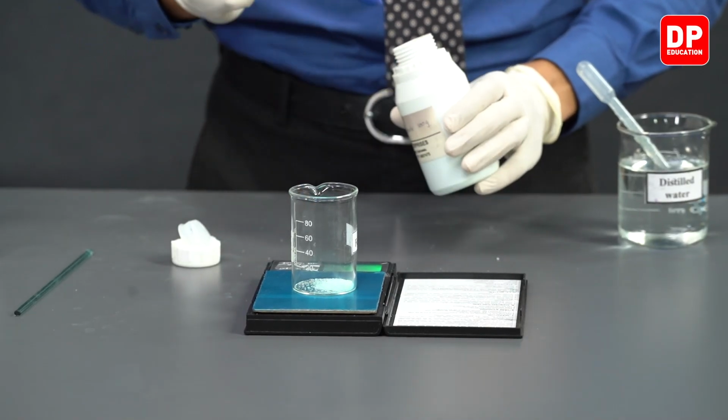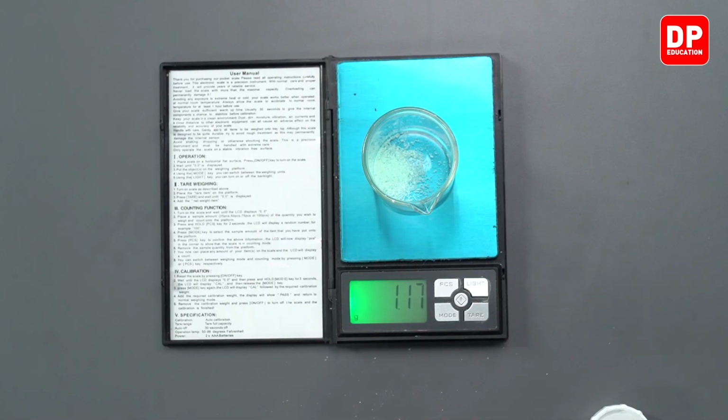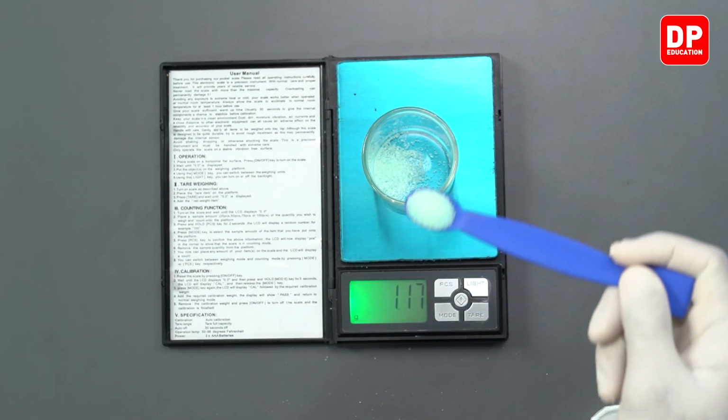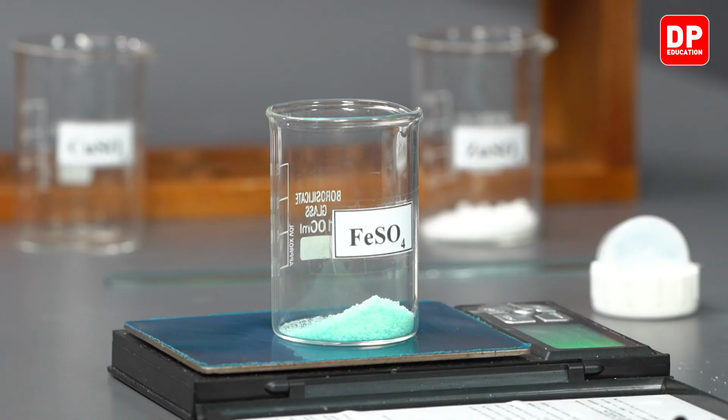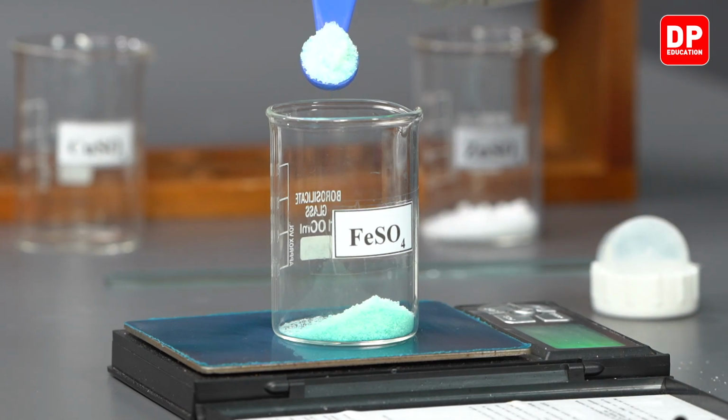We are trying to prepare 50 milliliters of ferrous sulfate solution with that concentration. So we need to measure exactly 7.6 grams. You can observe that ferrous sulfate crystals here are a light greenish blue in color.